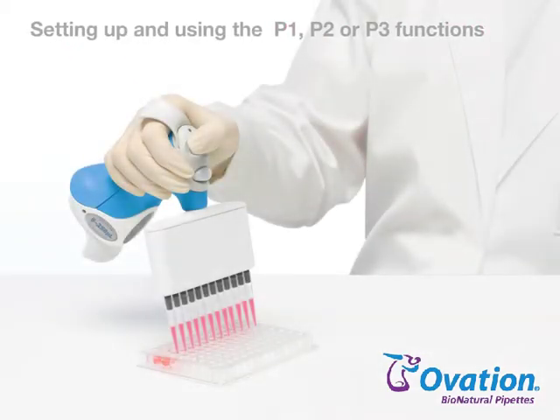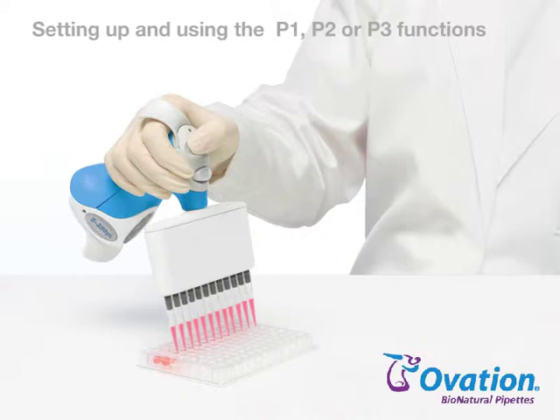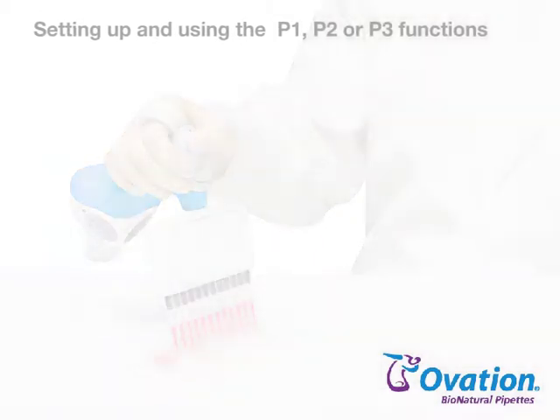The Ovation multichannel pipette provides three user-defined volume presets for routine pipetting at exact volumes with overblow. Volume and speed are stored for easy recall and use. To set up and run a P1, P2, or P3 liquid handling function, follow these steps.